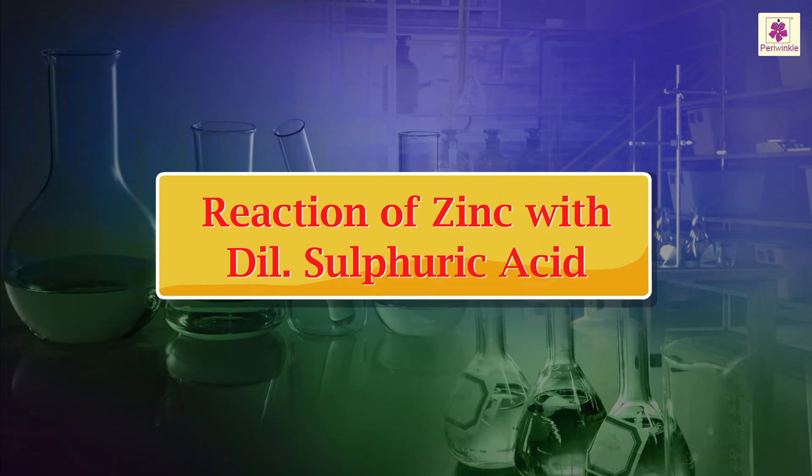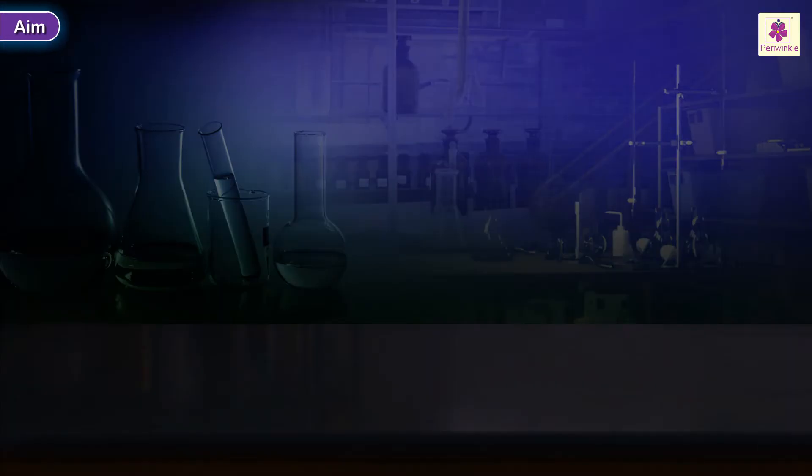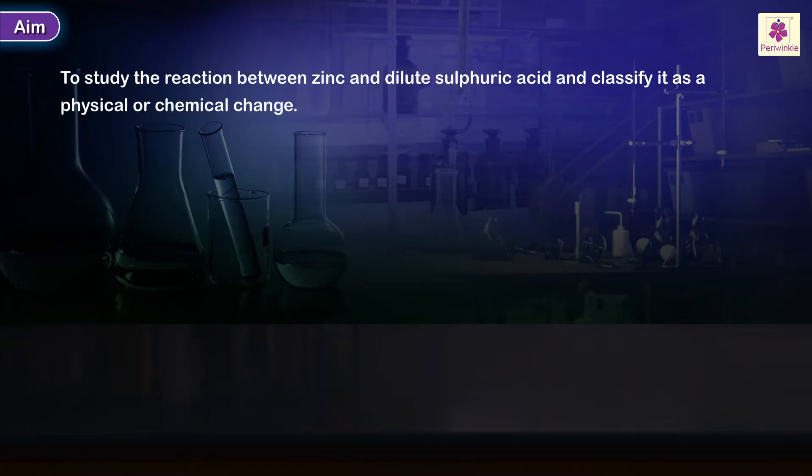Reaction of Zinc with Dilute Sulfuric Acid. Aim: To study the reaction between zinc and dilute sulfuric acid and classify it as a physical or chemical change.